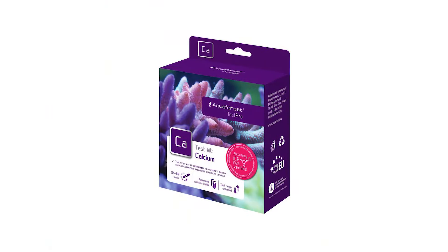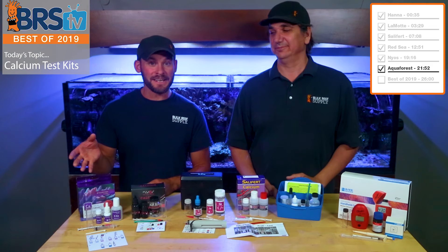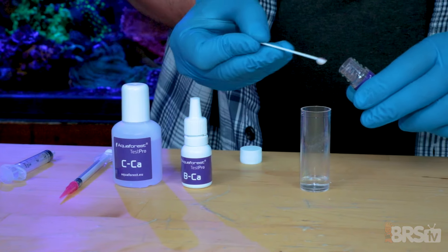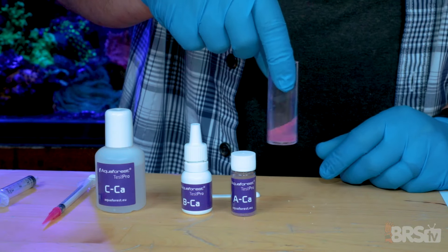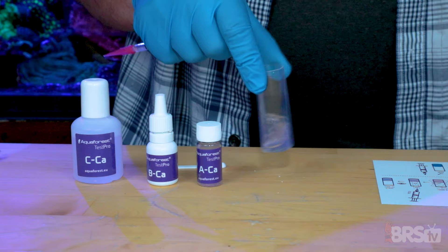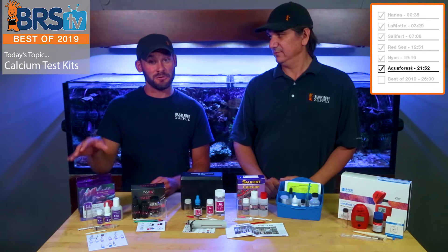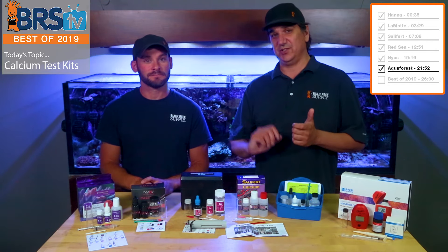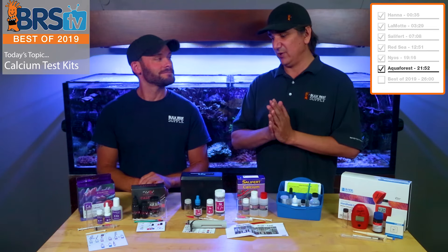The last one is the Aqua Forest calcium test kit. My favorite thing about this one is that Aqua Forest includes a reference solution in their test kit. You can check your testing procedure to make sure it matches or comes close to that reference solution — they say it should read within about 10 to 20 parts per million of the reference, which is a standard range for a lot of these test kits. The reference solution can actually teach you where the endpoint is, because you know that's where you should be stopping.